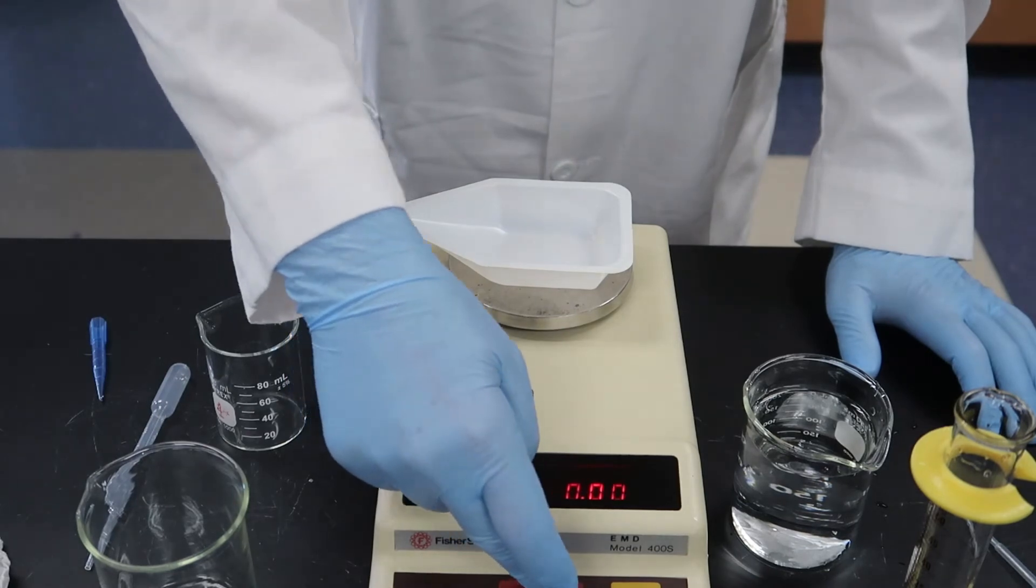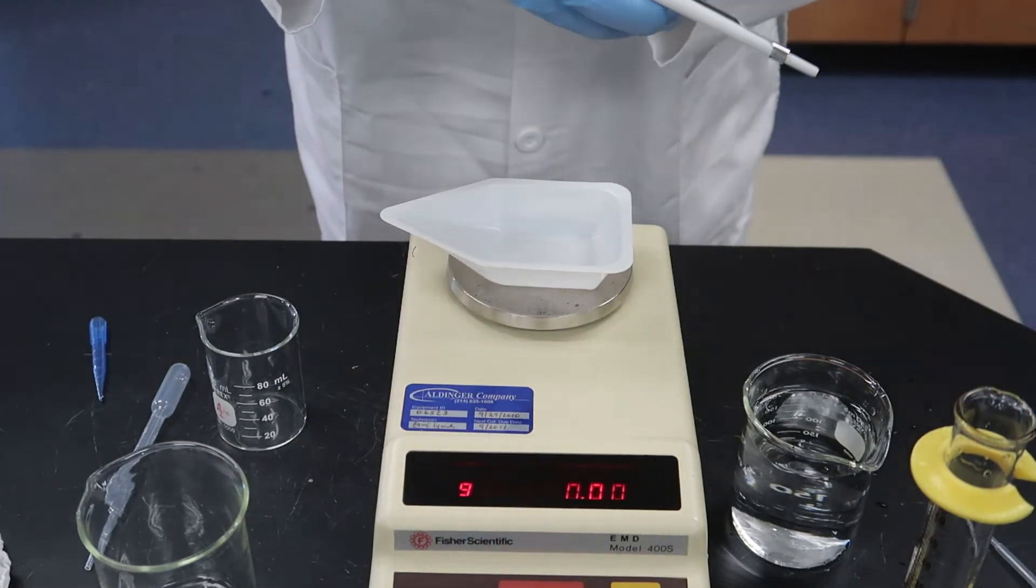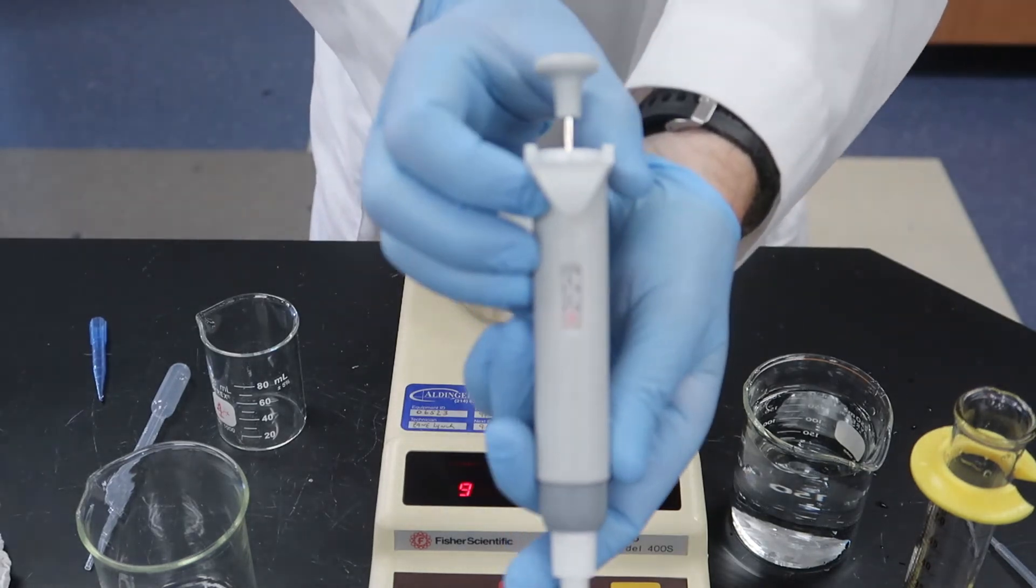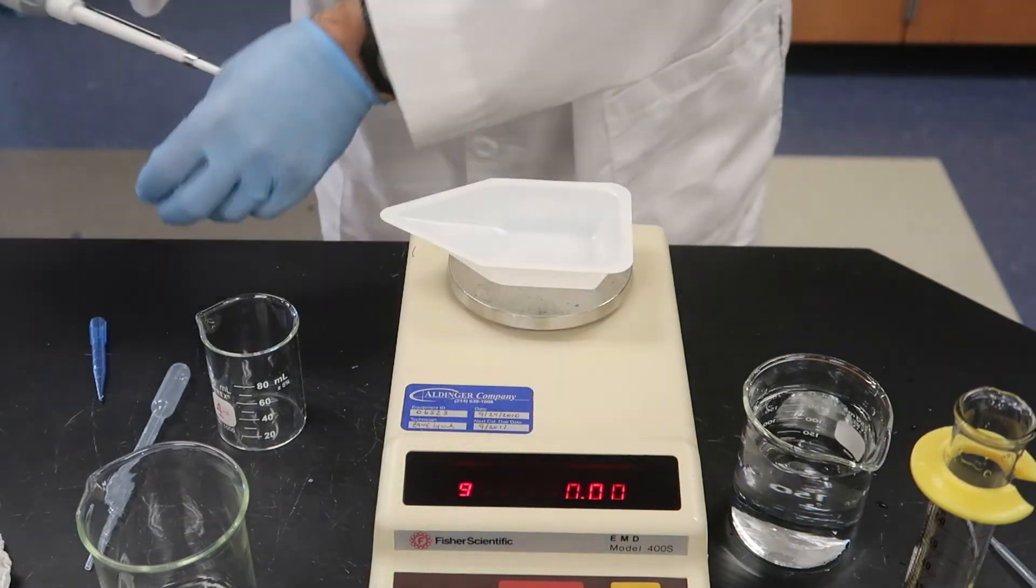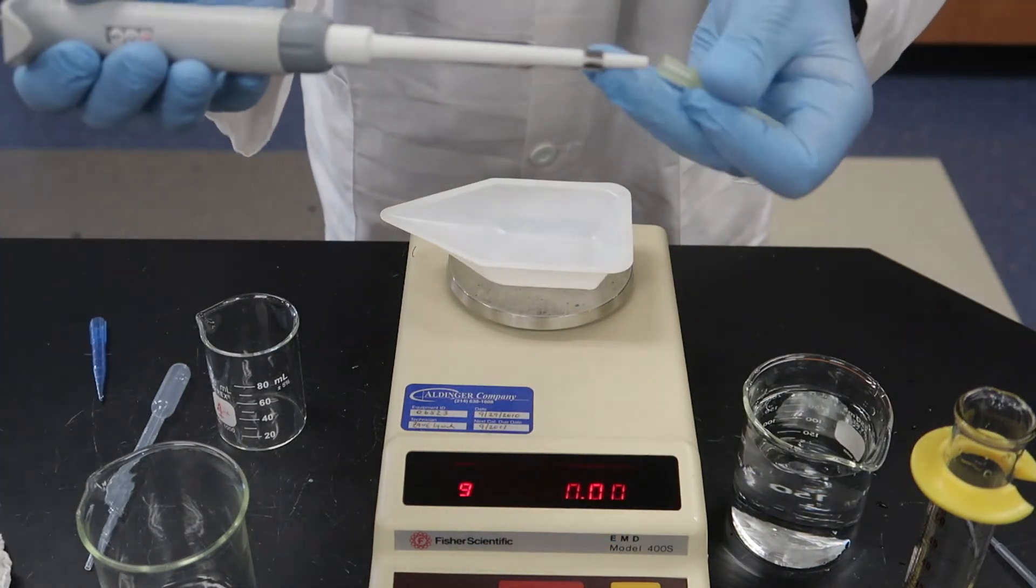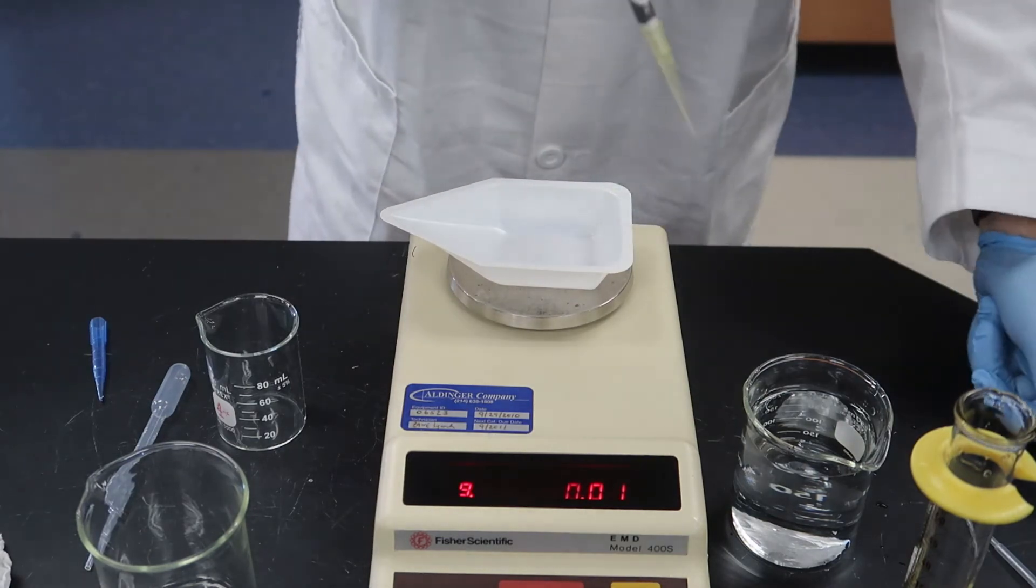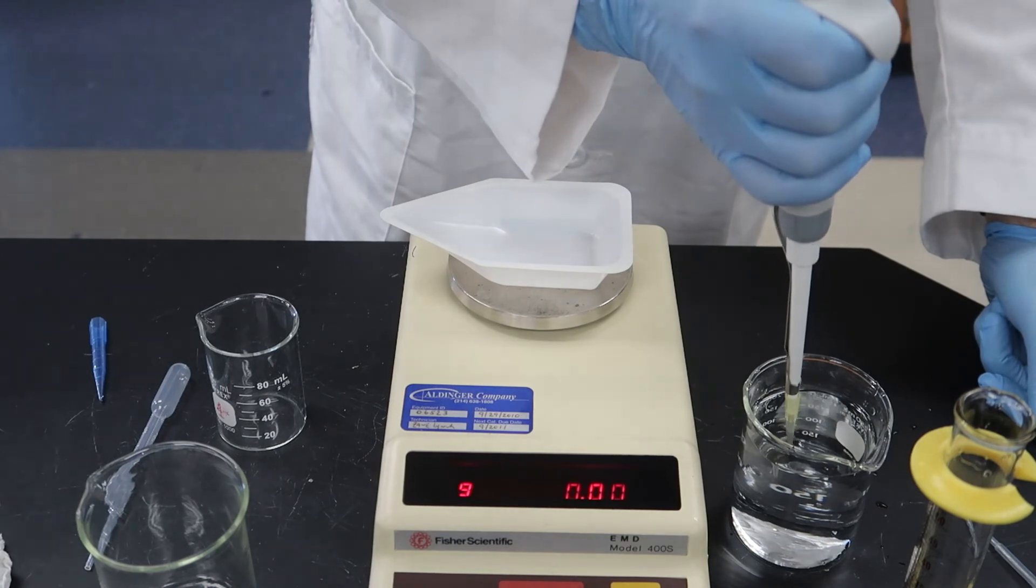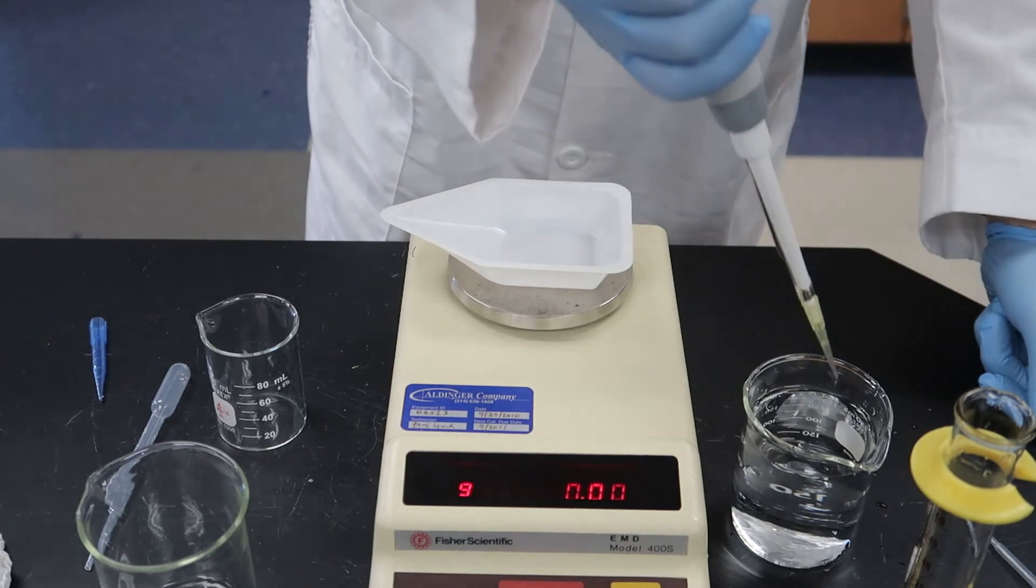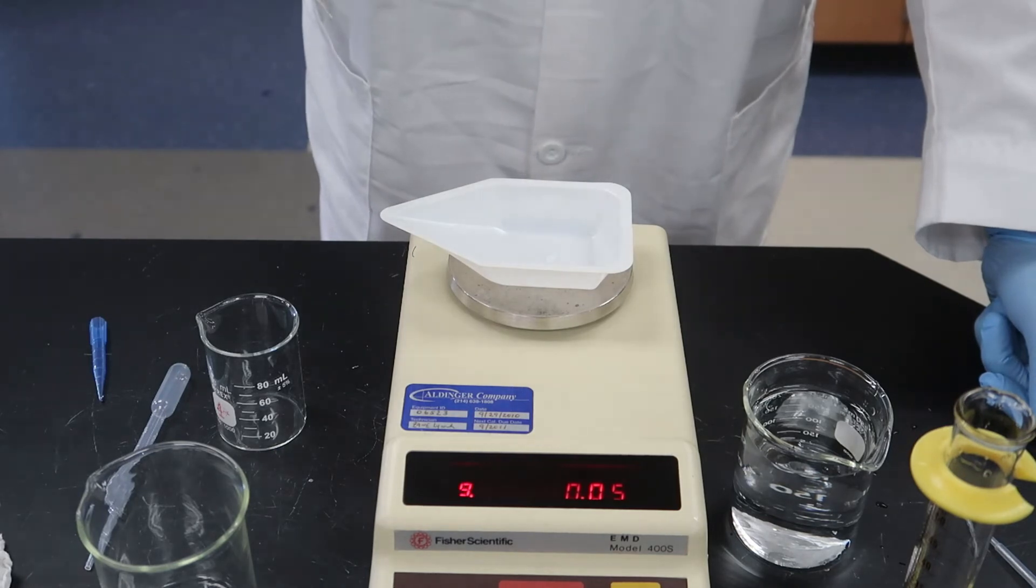All right, our last sample size is 50 microliters, a very small amount. So we're going to switch to the small adjustable micropipette. And you can't see it very well there, but it is set for 50 microliters. And notice we're using a different tip for this one, a smaller yellow tip for smaller volumes. Okay, and it looks like we got 0.05 grams.